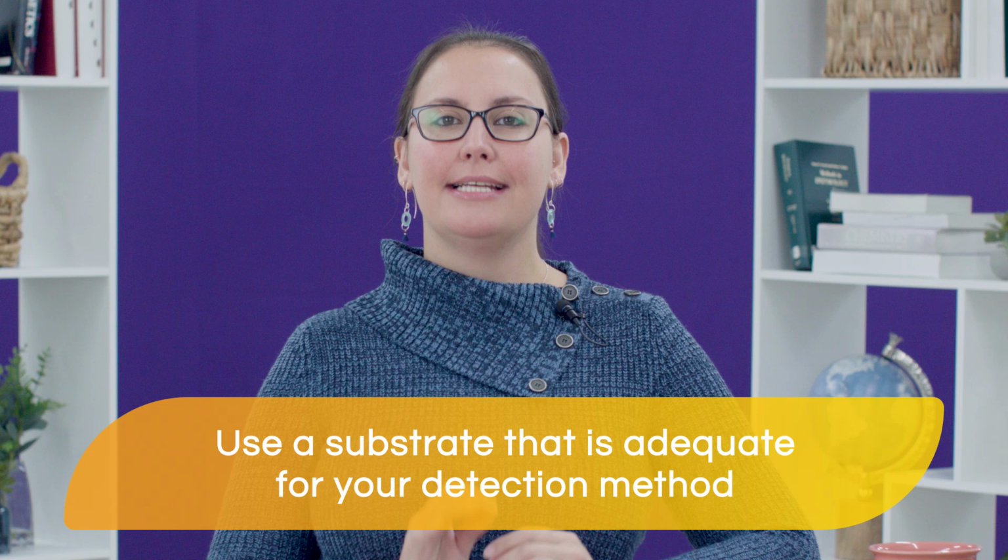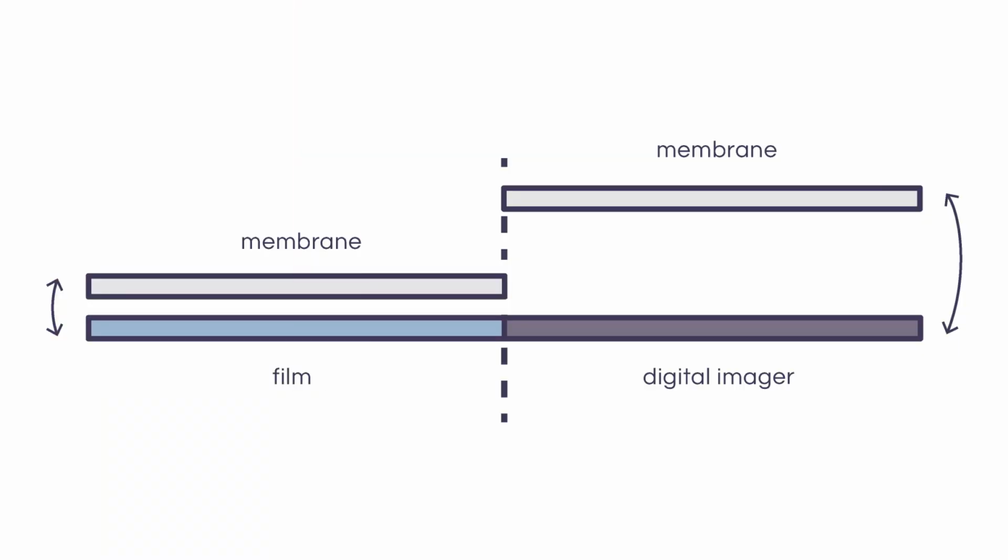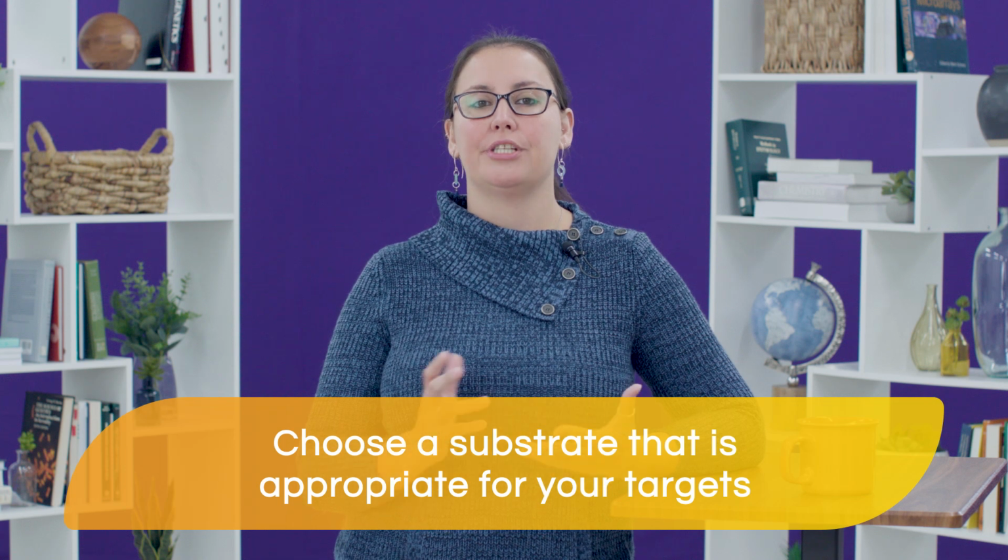Use a substrate that is adequate for your detection method. Substrates vary both on the rate of the reaction and the duration of the reaction. Therefore, substrates that may be appropriate for film detection could not work on digital imagers. Typically, when we're using a digital imager, we need to use a substrate that is capable of producing photons of light that are stronger, because those photons are going to have to travel farther to the detector than they would to the film.